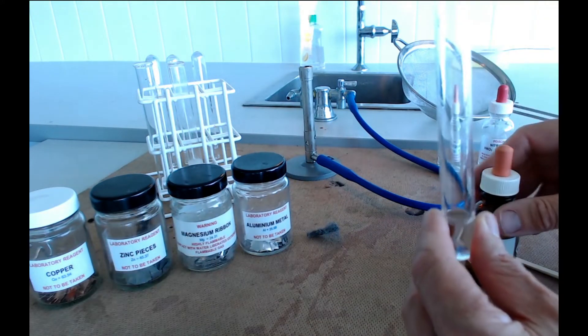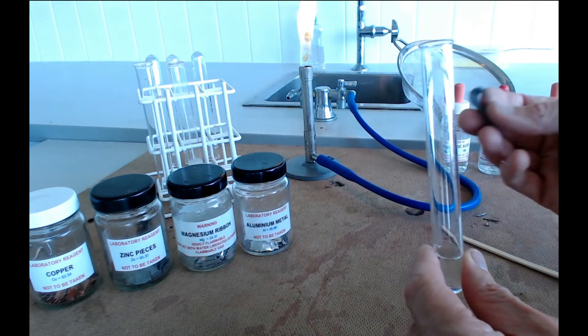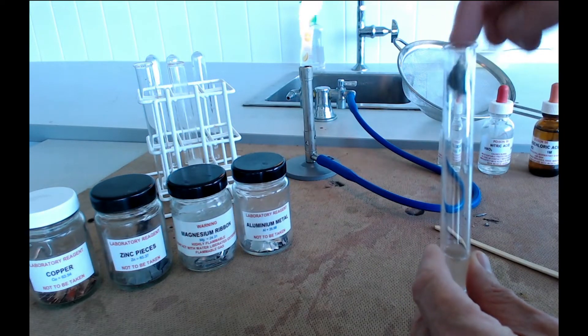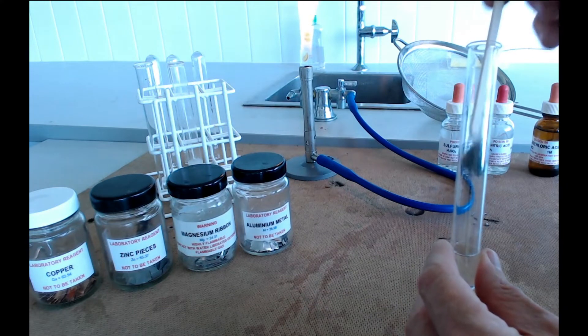Now, having got your acid in there you're now going to pop your metal inside it. So I'm going to start with my iron. And the iron wool might need some persuasion to get down to the bottom of the tube. But you just poke it down there. Make sure it's submerged in the acid.